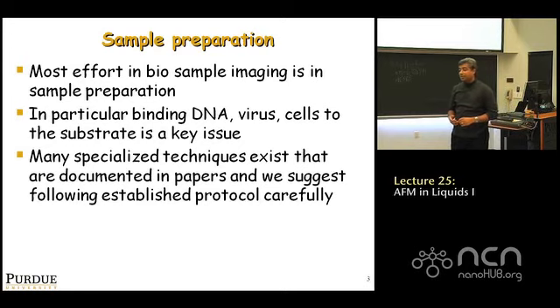So there's not a very clear unifying theme where one or two or three basic mechanisms can be used to do everything. At the moment, the area seems to be more of a list of recipes that you follow, and they work, some don't, right? So that's why it's hard to put everything together under common physical principles for immobilizing biological samples.